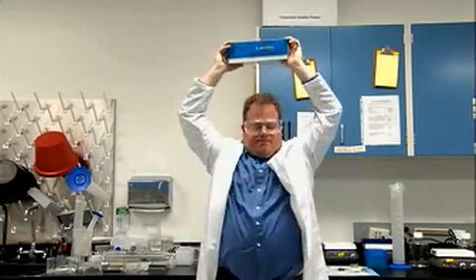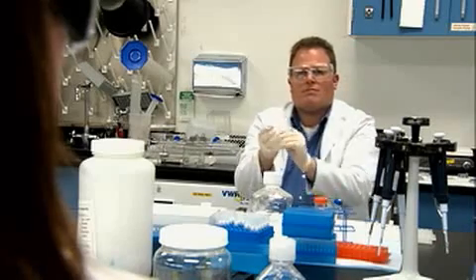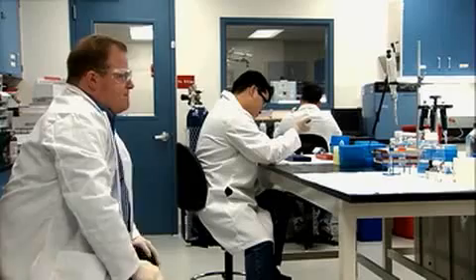This guy's isolating RNA with a thousand-fold less genomic DNA contamination. Now, I know he's got the skills, but you have to be asking yourself how much this new Agilent kit has to do with that.